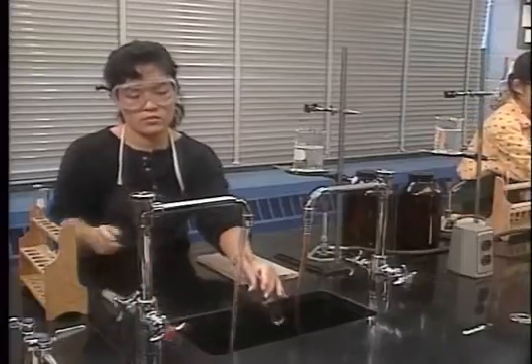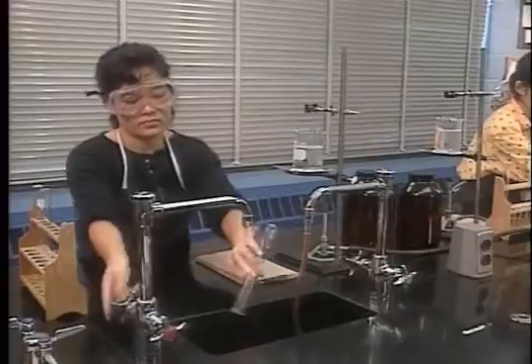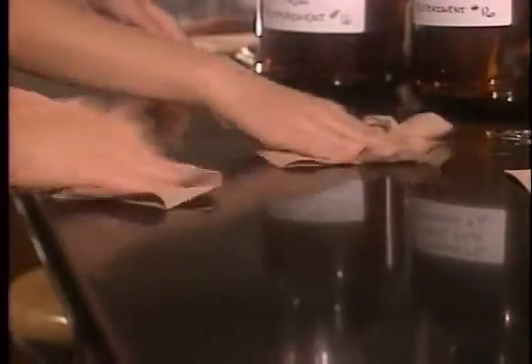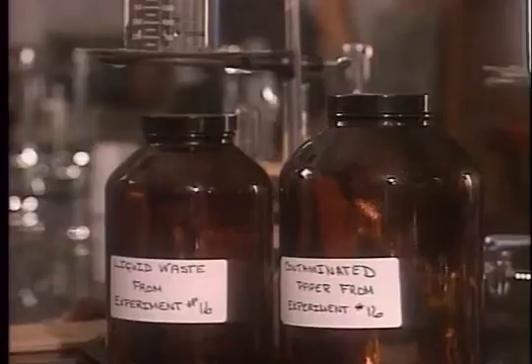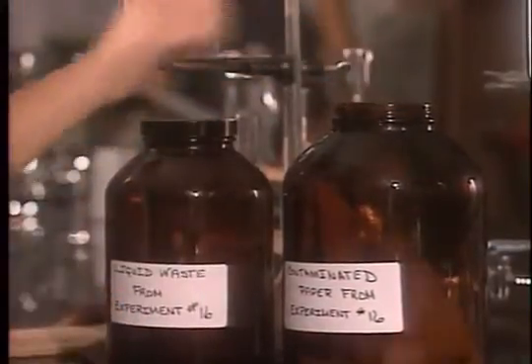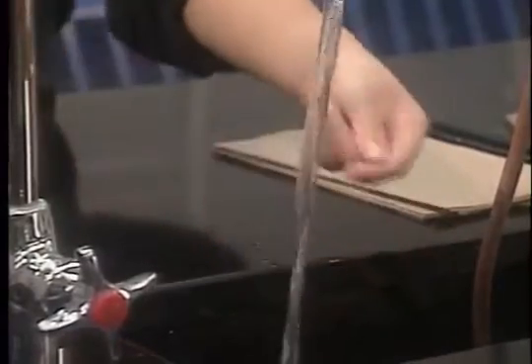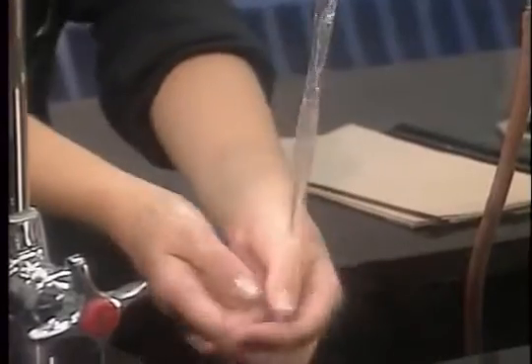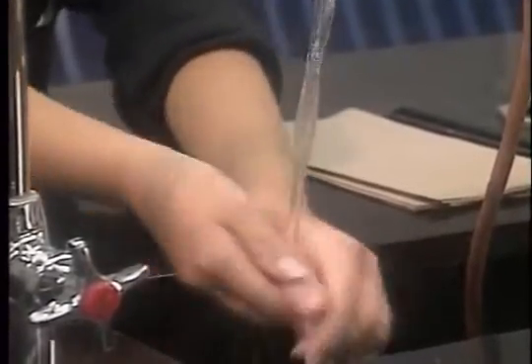Glassware should be thoroughly scrubbed and rinsed so it's as clean as possible for the next experiment. Liquid puddles or powders left behind on the lab bench can get on the next person's clothing or skin. Wipe them up thoroughly and throw the paper towels away in the proper container. And clean chemicals off your hands before leaving. There may be invisible chemical residues that could damage your skin or contaminate your food the next time you eat.